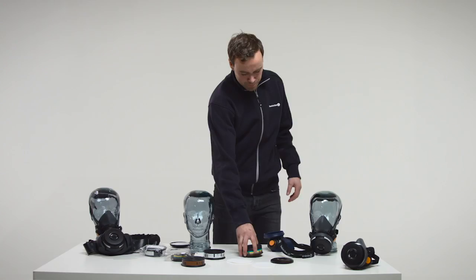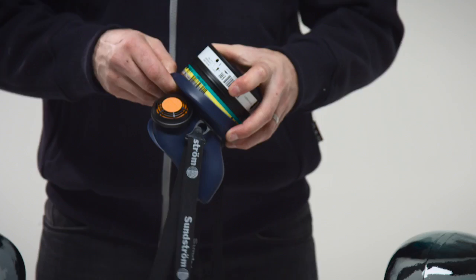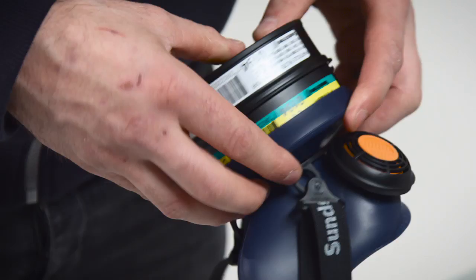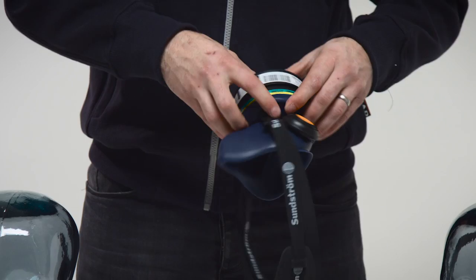Fit the combined filter in the mask so that the arrows on the filter point towards the user's face. Carefully check that the edge of the filter is in the internal groove of the filter mounting all round.